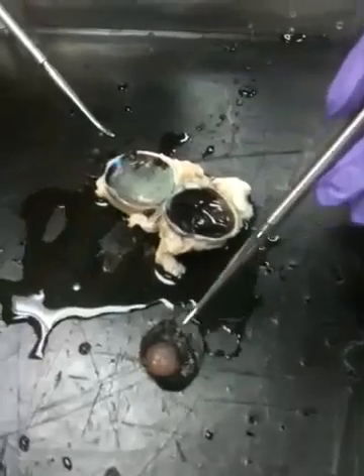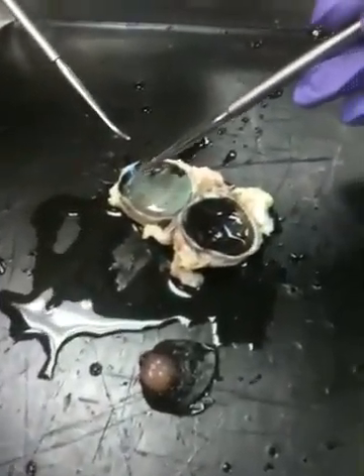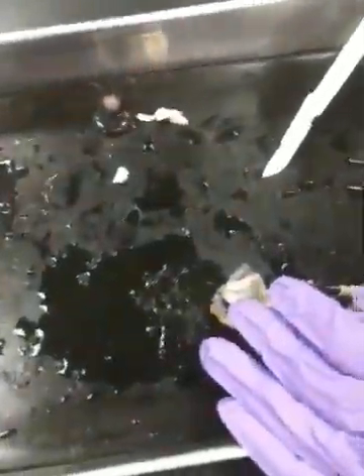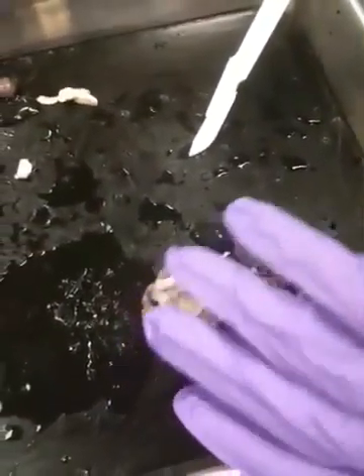So snot, and then so the vitreous humor, all the ciliary processes and suspensory ligaments, and the lens there as well. And you can see all of the retina intact here. Okay? Now we need to find the choroid. Yeah, exactly, and a detached retina doesn't function, so that's why they'll have to reinsert the pressure somehow.